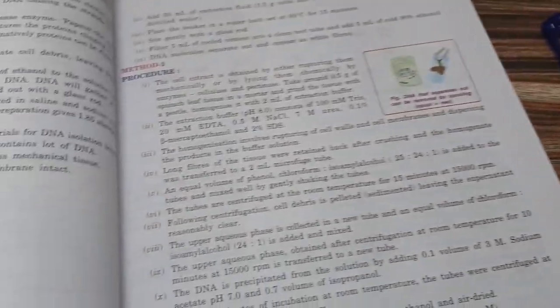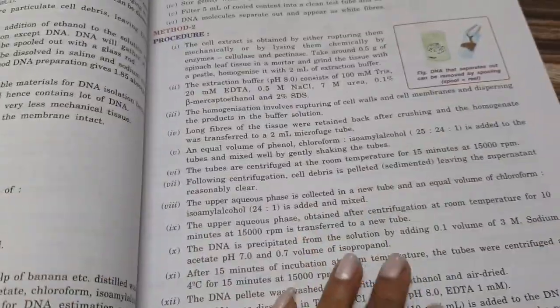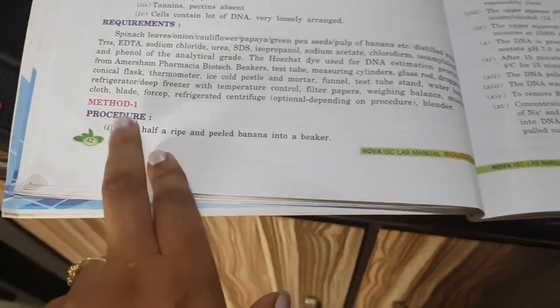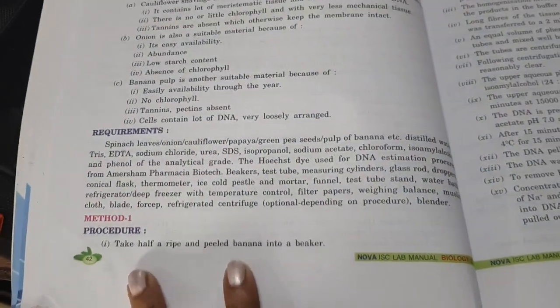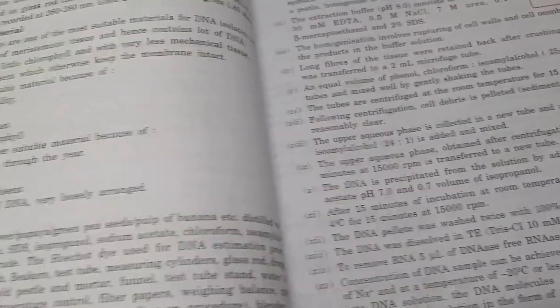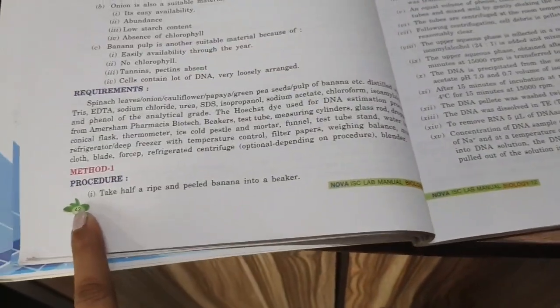Actually, not method 2 — we are doing method 1 procedure. Method 1 is the most convenient method; you can easily understand and go through it. Method 2 is a little bit difficult, so we are using method 1. Any one method can be done. So go through the book after the experiment. Now let's start.